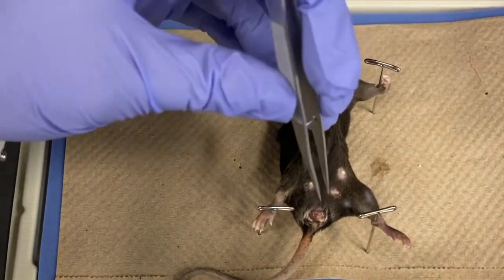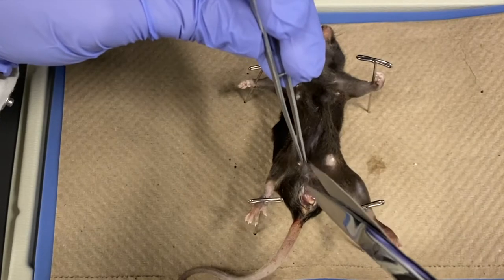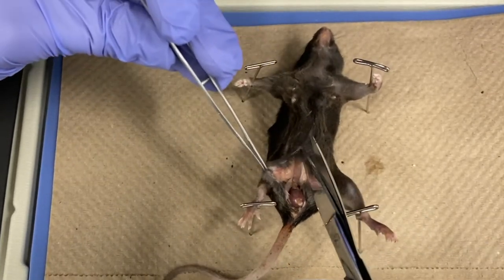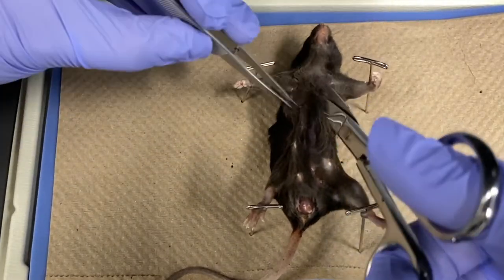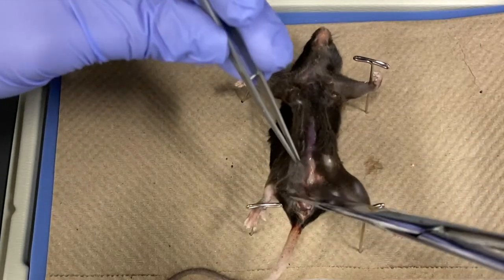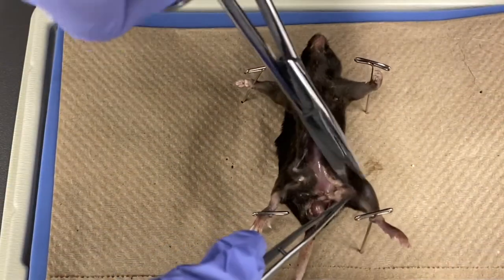With the forceps, grab hold of the skin just above the orifice. Make a small incision in the skin using scissors. Cut the skin from anus to chin and then out to each limb. Cut slowly and carefully, keeping the tips of your scissors pointed upwards. Don't cut too deep because you don't want to damage any of the organs underneath.